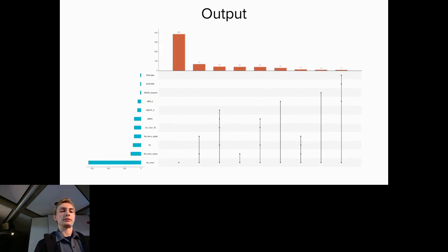And then here's an interesting one. It's an UpSet plot. So on the left histogram, you have the distribution of domains. And then the one at the top, you have the distribution of the domain architectures.